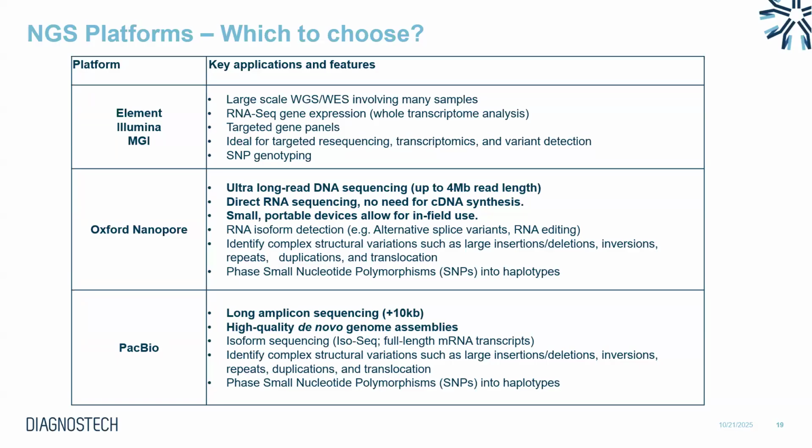However, certain analyses are improved by very long sequencing reads, up to several kilobases. And these are generated by our long-read sequencers, such as PacBio, and the long reads are able to span large repeat regions, enabling near complete de novo assembly of small to medium-sized genomes with improved assembly of large complex genomes, such as plants and animals, and then more sensitive detection of large structural variants. They also are very beneficial for complex genomes that are highly repetitive in nature and have GC extremes.